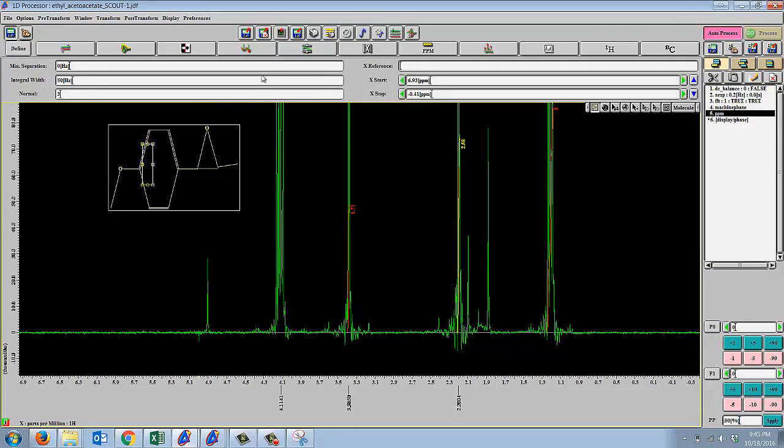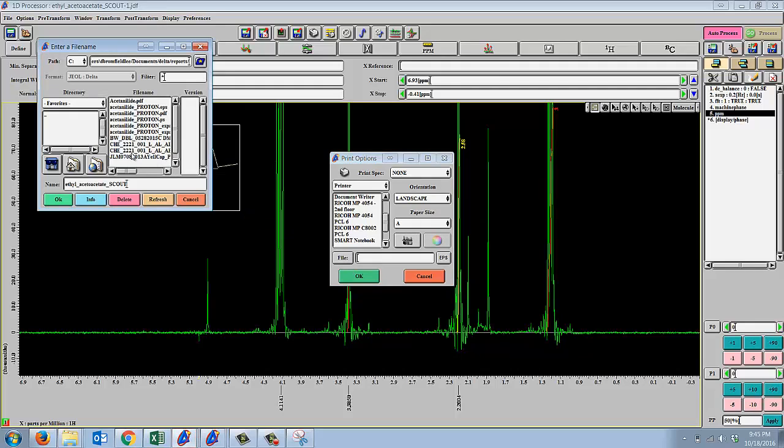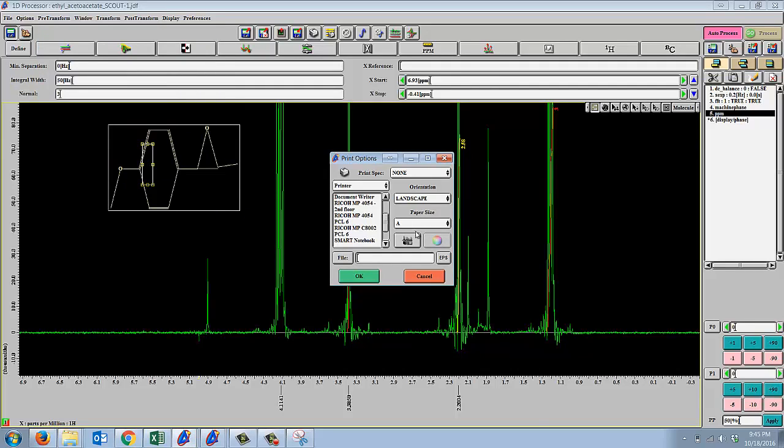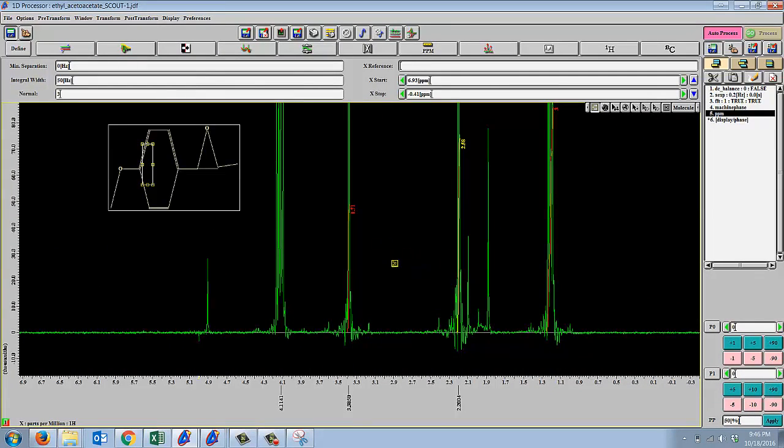And you could also print your spectras as images. There is PDFs. If you have a PDF writer on your computer, so Qt PDF writer for PCs is actually free. On Macs, they are included in your Mac. You just need to look at how to use it. You can save your file as a picture, so you can actually save it as a picture and then import it. So there are all sorts of various options. I can save this as an actual image, and I'll give it a name. But play around with yours, because a lot of that is highly dependent on your actual computer.